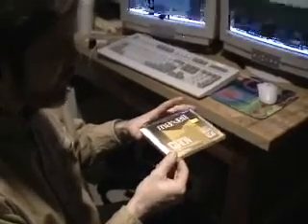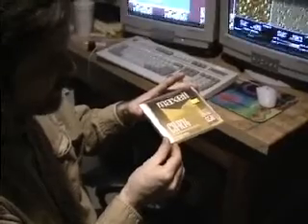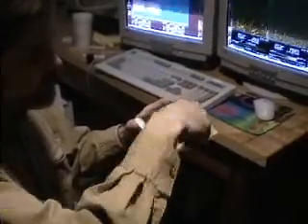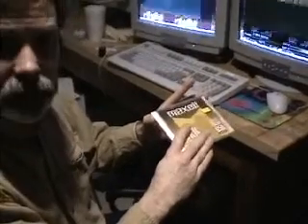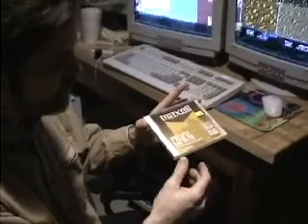but it's important for you to understand how they work. When I have a sample and I mount it on the microscope slide with double-sided sticky tape, it's going to wind up being at a little bit of an angle no matter how careful I am. And so when I scan it, if I didn't do anything else, I would get an image that was really bright in this area and really dark over here because of this tilt just from the way I've mounted it.